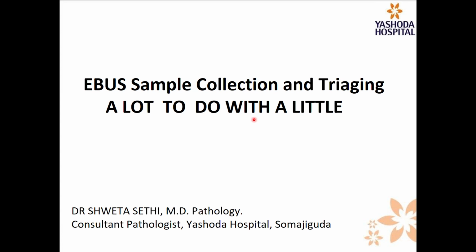So my topic for today is EBUS sample collection and triaging, a lot to do with little. Please don't get offended when I say little, because I will show you that whatever samples are sent to us, when they are processed and formed into a cell block, how do they look actually?